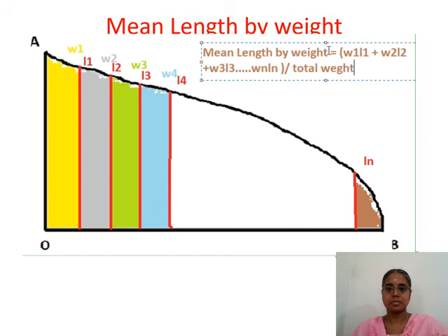So I hope you have understood the mean length by weight.